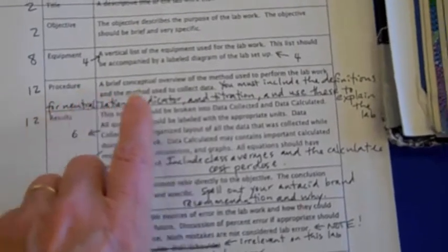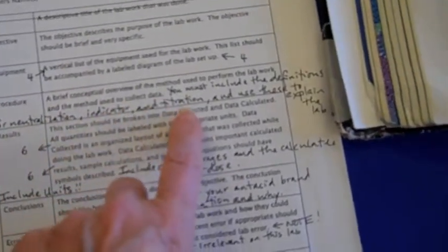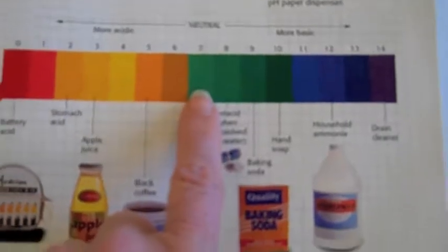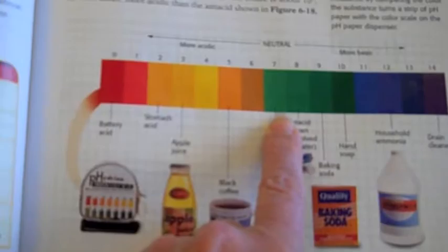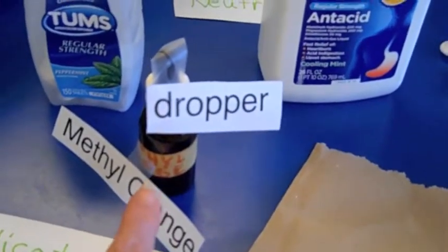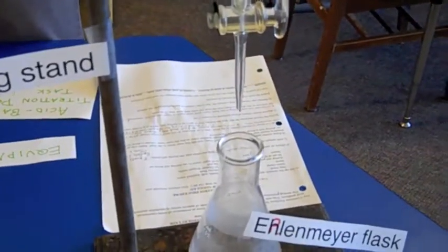The procedure, and this is important, in the procedure you should give definitions for neutralization, indicator, and titration. Neutralization is that moment when the acid and the base are neutralized in this lab. An indicator is, in this case, a nice simple indicator. It just tells you when something has become acidic. And titration is that process of changing the chemical property of something drop by drop.